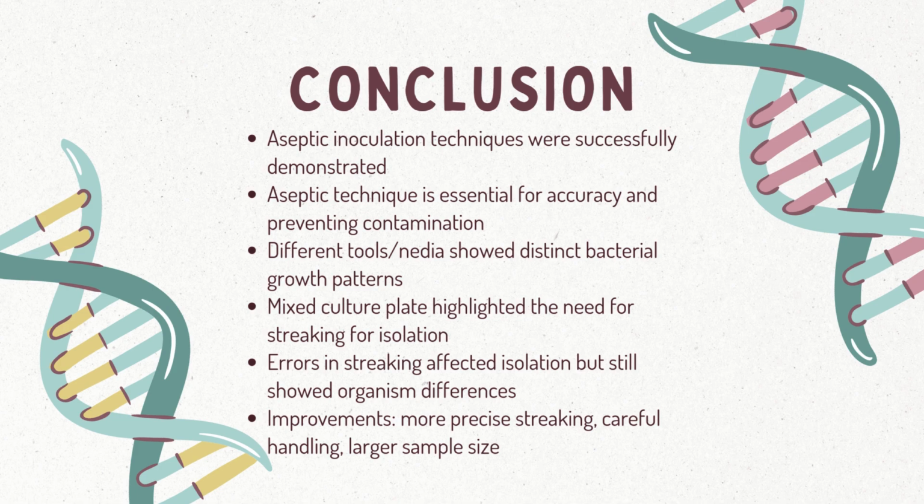This lab emphasized the importance of aseptic technique in microbiology. Without it, contamination could make results unreliable or even unsafe. Overall, the experiment connected directly to why aseptic technique and streaking for isolation are fundamentally important in microbiology and clinical work.